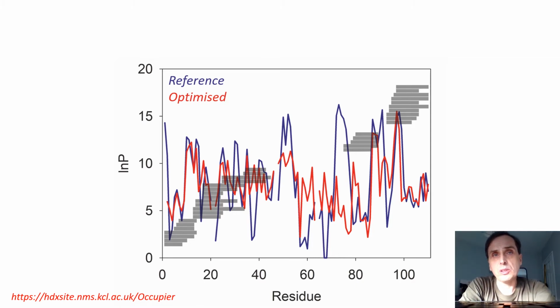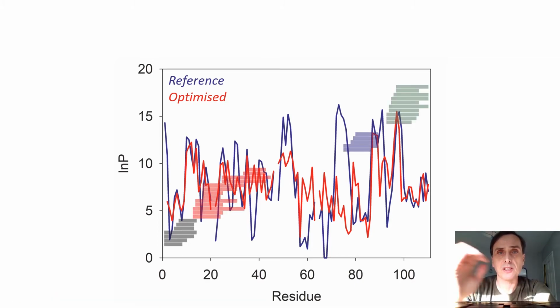What we also notice is that the performance of the optimization is variable throughout the data, so we thought that it might be best to split the data into different subsections, as shown here. There are 4 different subsections: a black one, a red one, a blue one, and a green one, and we optimize each of these subsections independently.